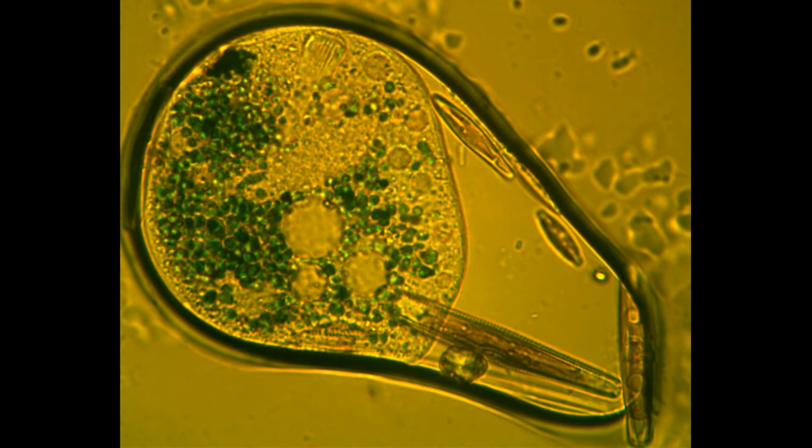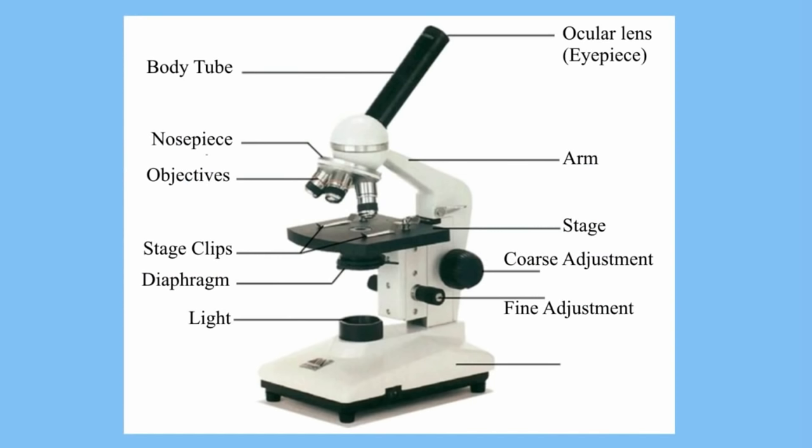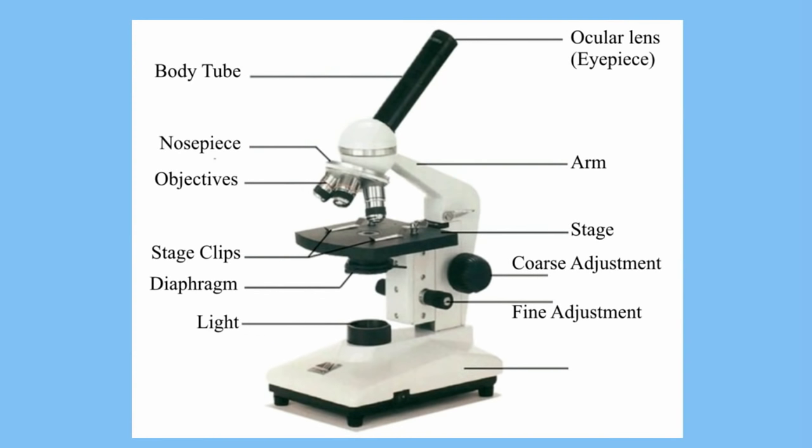Here's how to use a compound microscope. Let's go through the parts before I give you some tips on focusing. First you have the eyepiece, which is what you look through. Next, the tube connects the eyepiece to the lenses. The arm supports the microscope and you should carry the microscope using the arm. The base is the bottom of the microscope and it's used for support. Next we have the light source, which provides light for the slide so that you can see something.